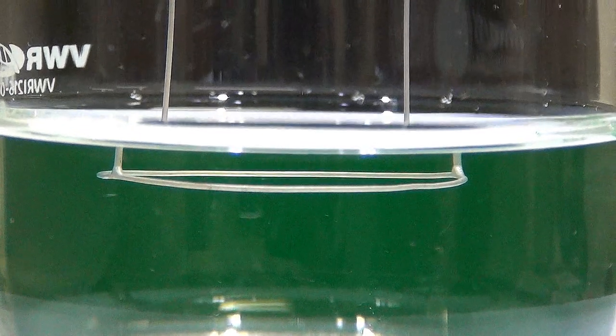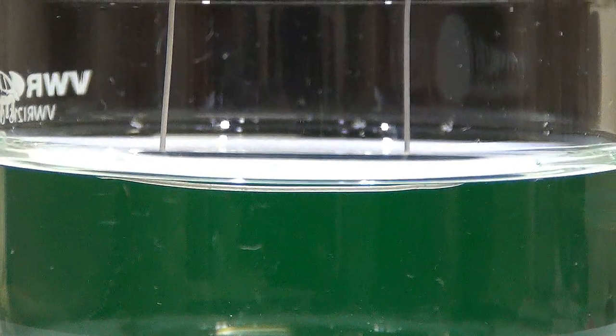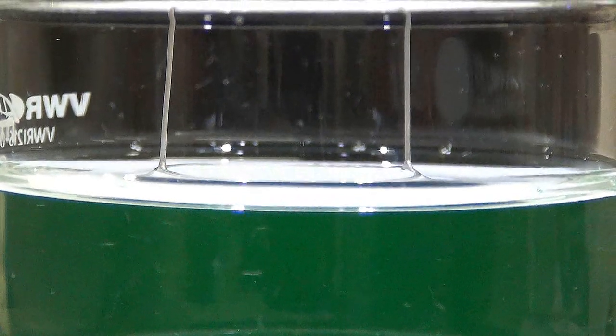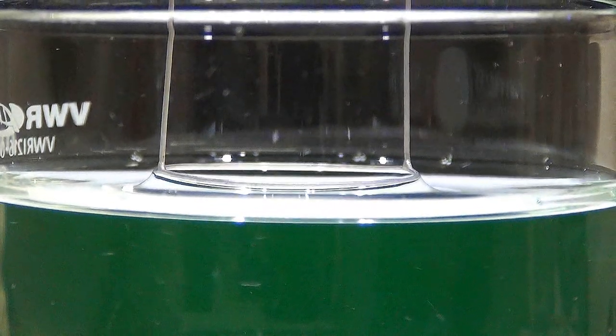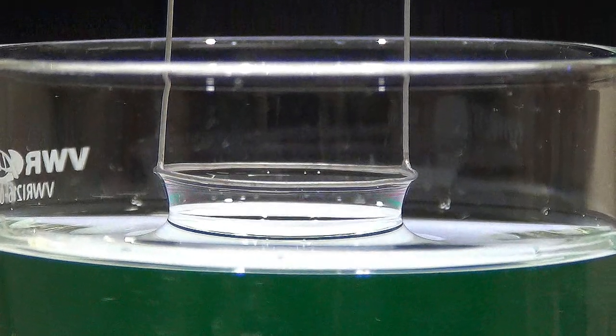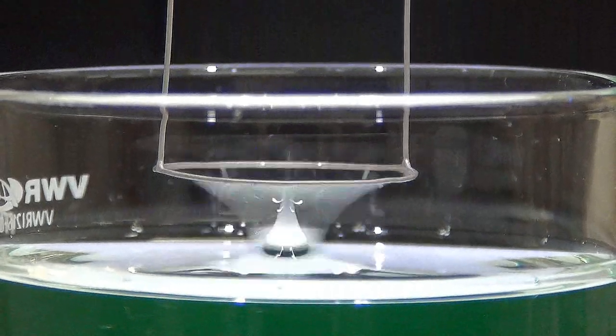Surface and interfacial tension are also used when necessary to obtain a more accurate numerical result. In surface and interfacial testing, a ring is used to measure the tension between the air or fuel. This tension is visually noticeable. If the tension is low enough, the solution will form a film.